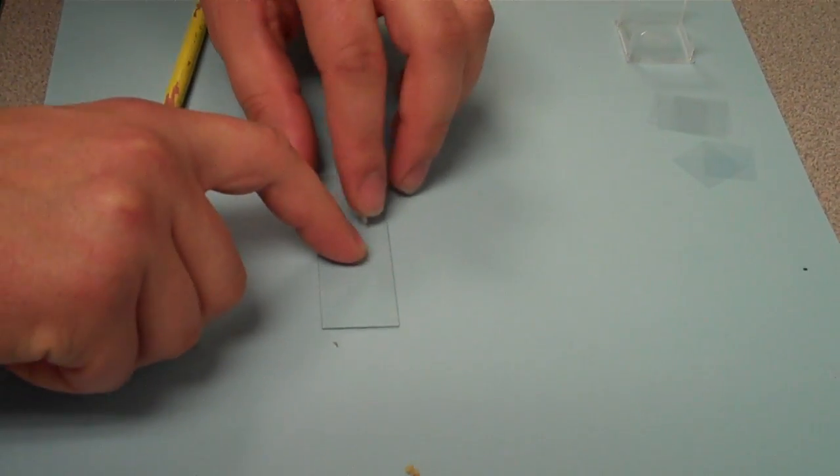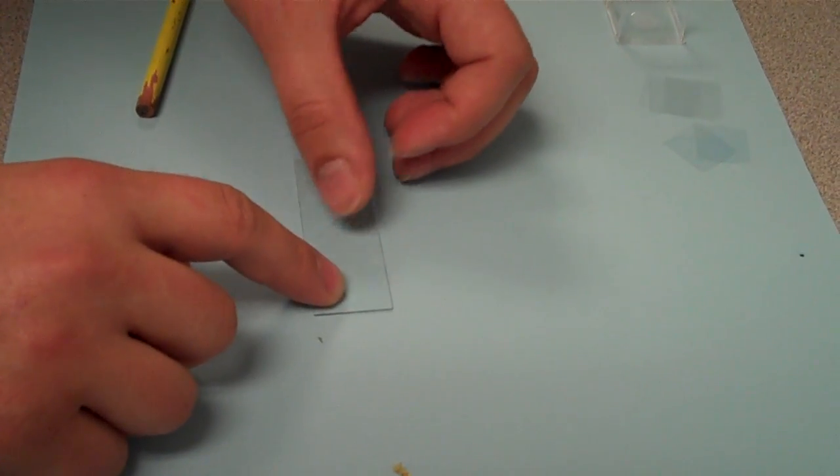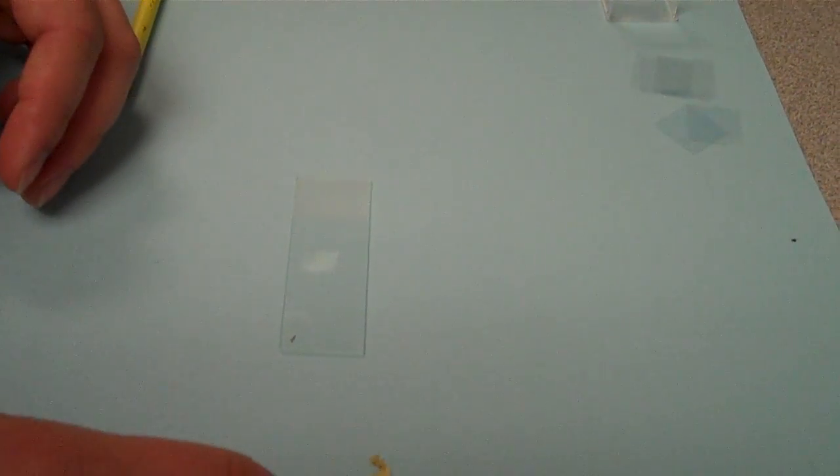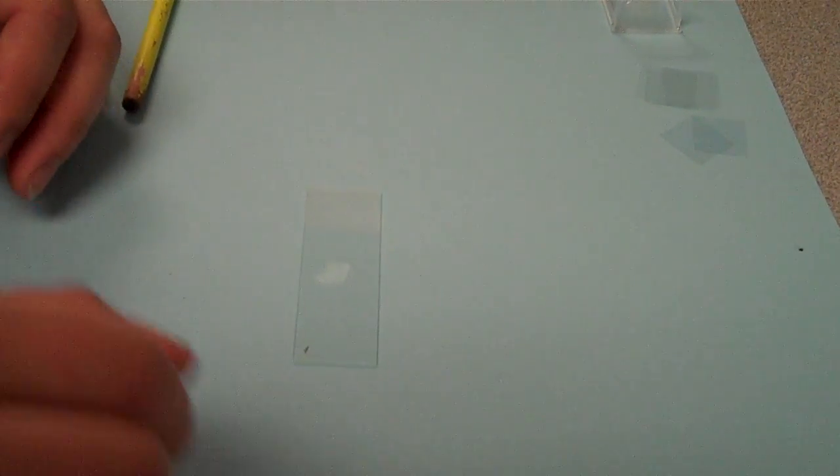And then you stick it to the slide. Now if you're using a new slide, you won't need to clean it. If you're using an old slide, just give it a bit of a wipe down with alcohol first and let it dry off.